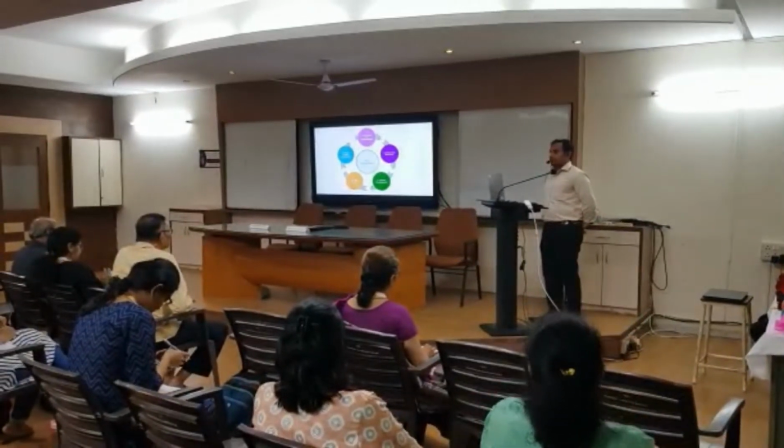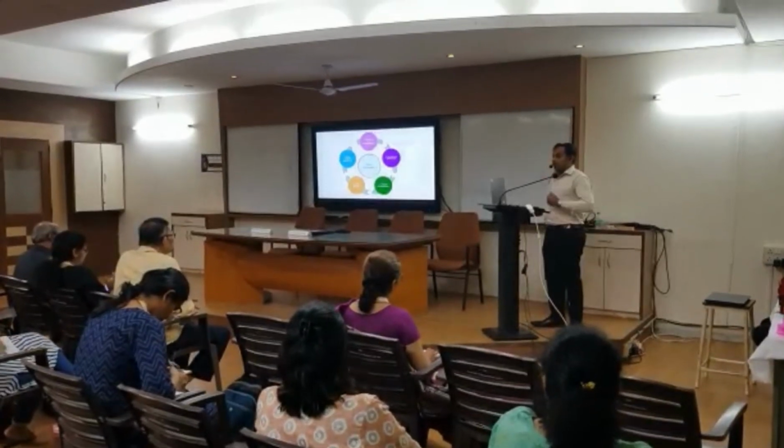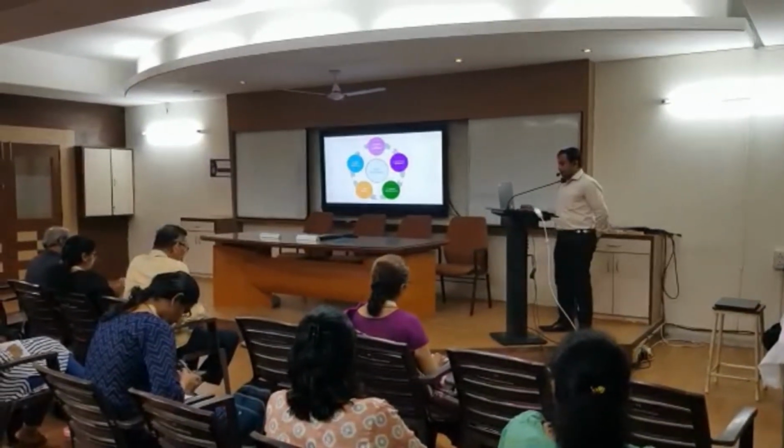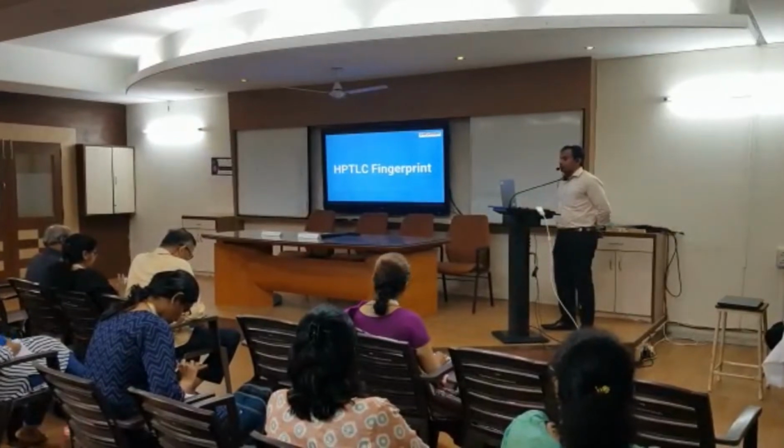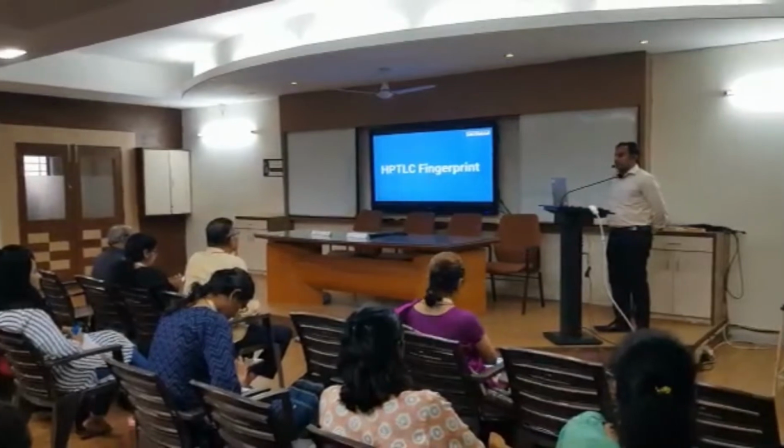In the first process, HPTLC is very useful, and it may also be used in the further processes. So the first aim is to separate. Why is separation important?